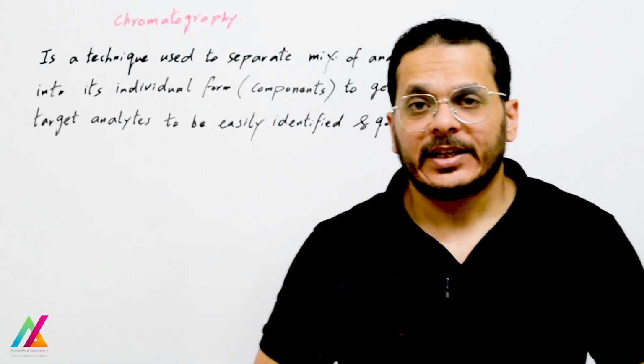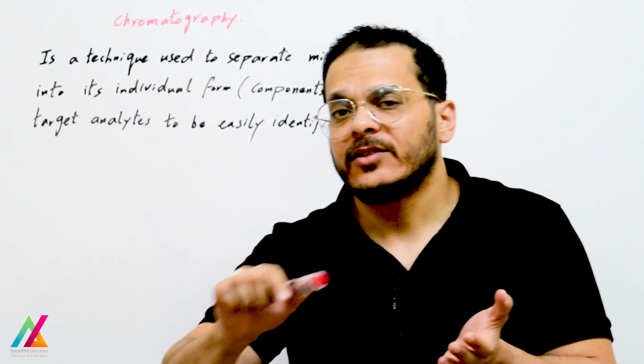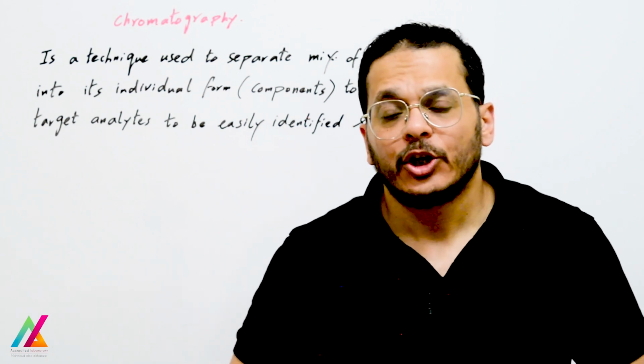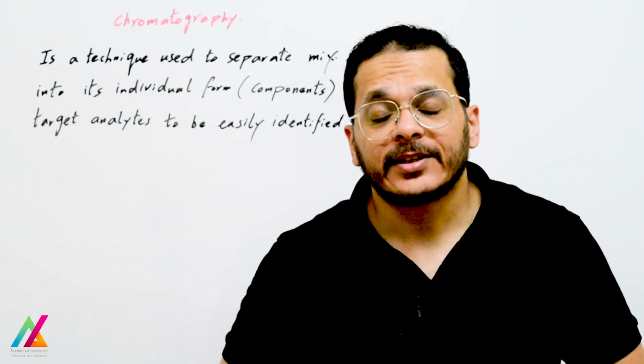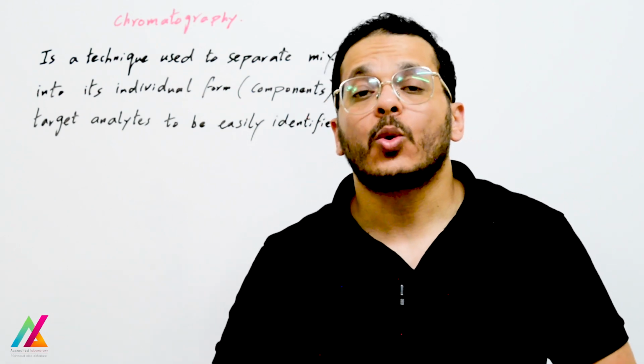Chromatography is a technique used to separate a mixture of analytes into its individual forms or components, so that only the target analytes that need to be analyzed can be easily identified and quantified.